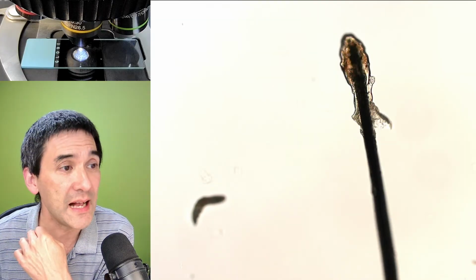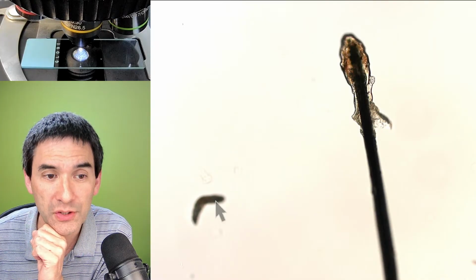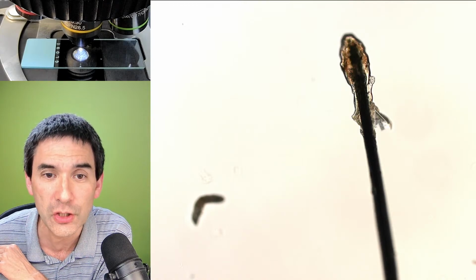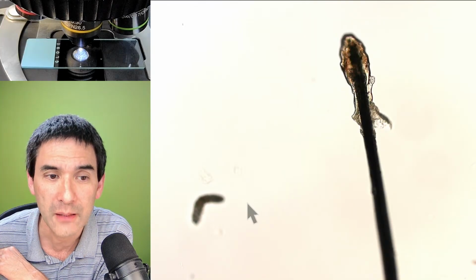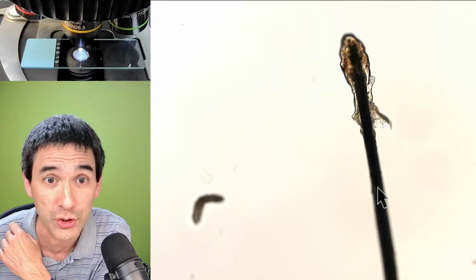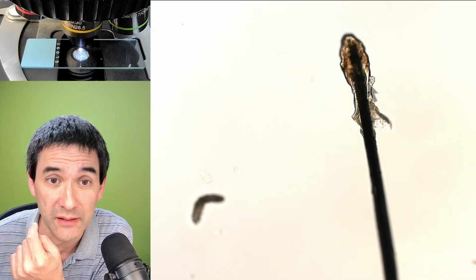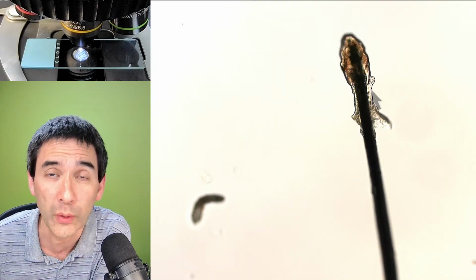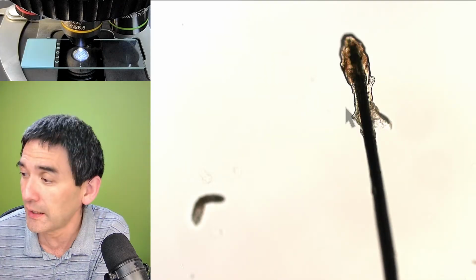And the reason why this eyelash is on here is because of something quite interesting. I'm going to use the arrow right now, because this face mite over here, which is a little bit blurry because it's out of focus, used to be in here. Then it broke free, and now it's over here. You see that the diameter of this face mite is less than the diameter of one of my eyelashes. This is the place where the eyelash is inside the skin, like the hair follicle, and the face mite is living right here because it's a very fatty and oily place, and it feeds on fats and oils.